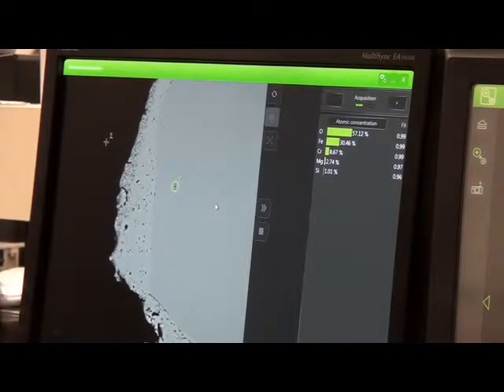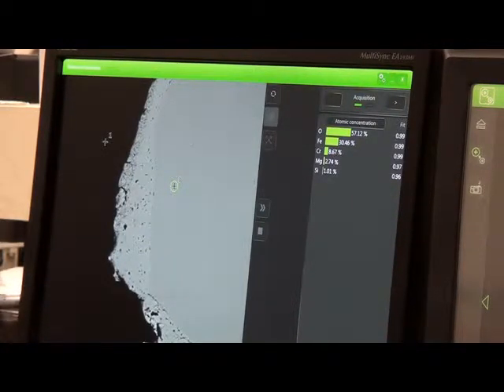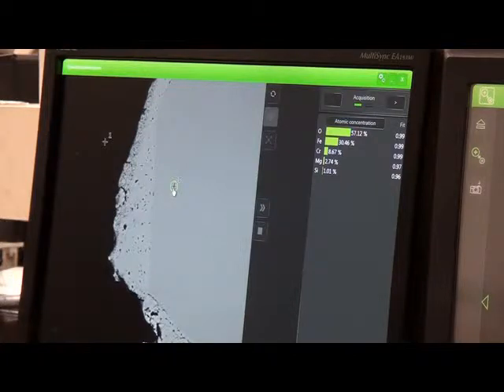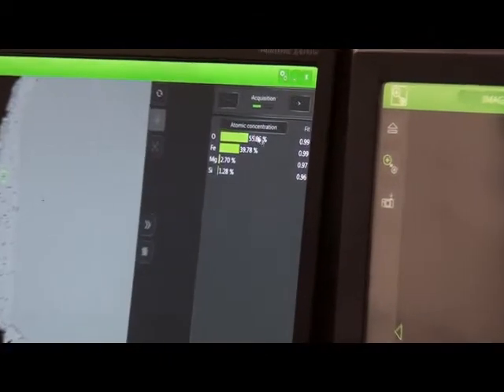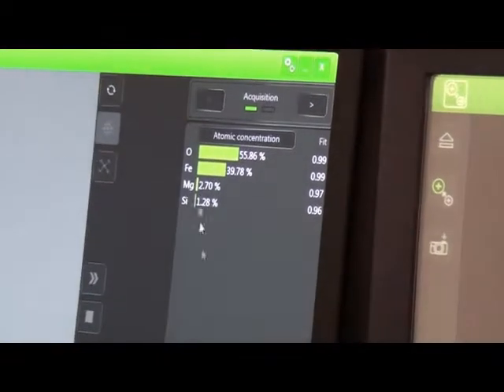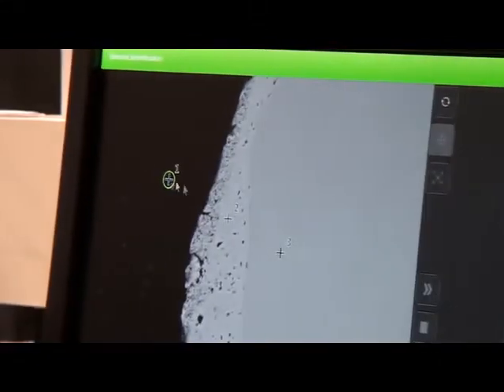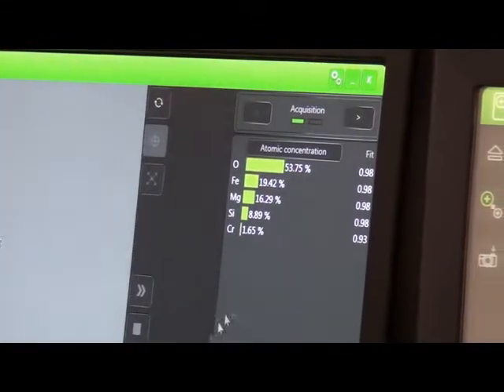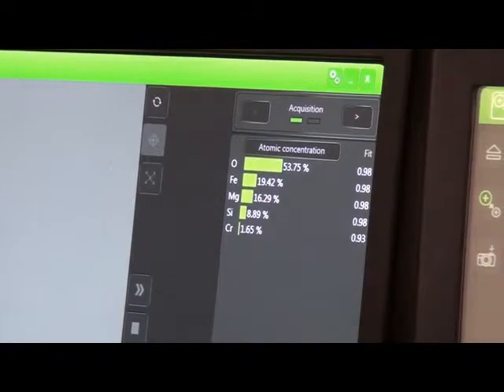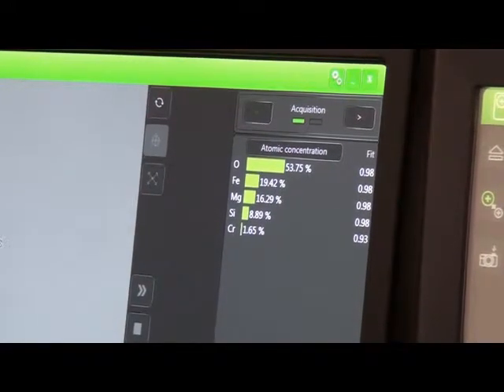So where's the chromium at highest? Okay. And so if you can click on number two, what does the chromium look like there? It's really very little. And on number one? Right. This is just a trace. What you're seeing is a chemical reaction.